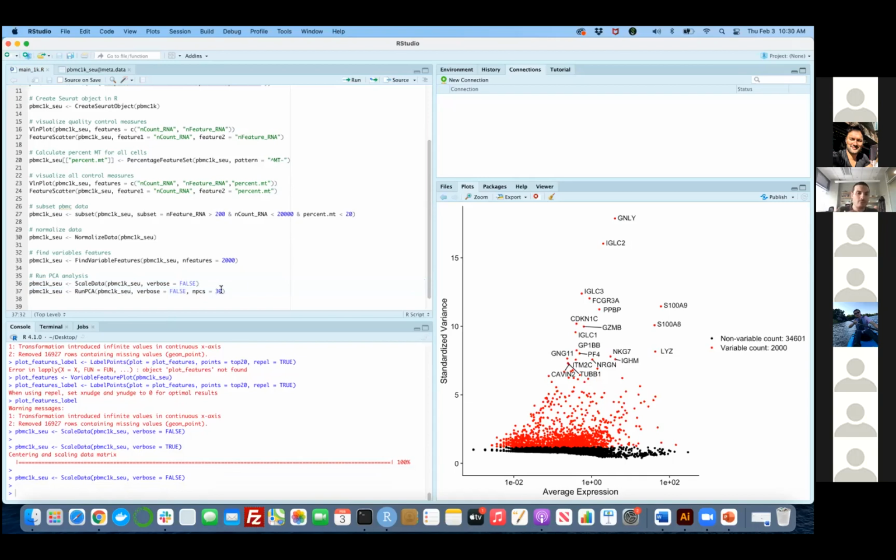What we really want is to not use all those 2,000 genes, but to use some 30 combinations of 2,000 genes that are more informative than other combinations. So you have 2,000 variables here, and you're going to have the same amount of principal components, like 2,000. Theoretically, some number of those with the highest variance are the most informative, and after some point you don't really have to use them. You can just pick the first 20 or 30, or whatever the number. So let's quickly run this again.